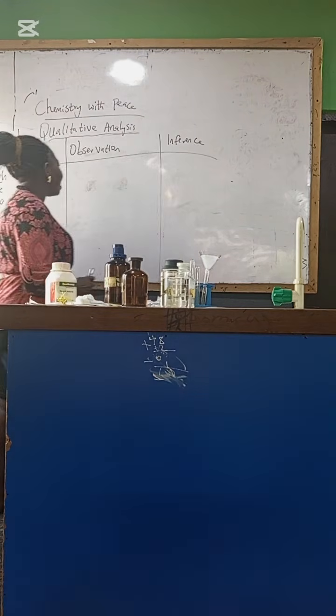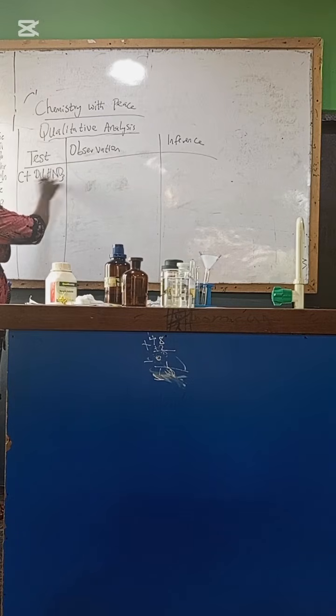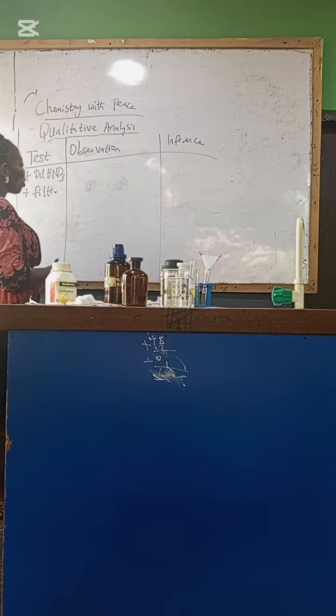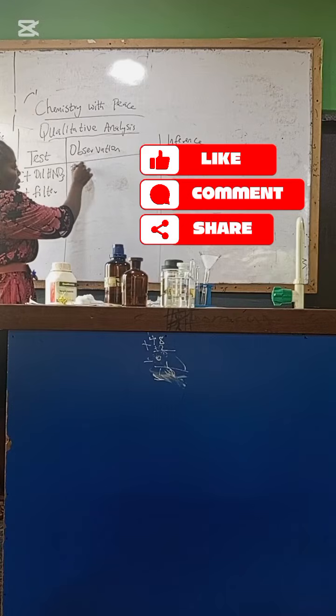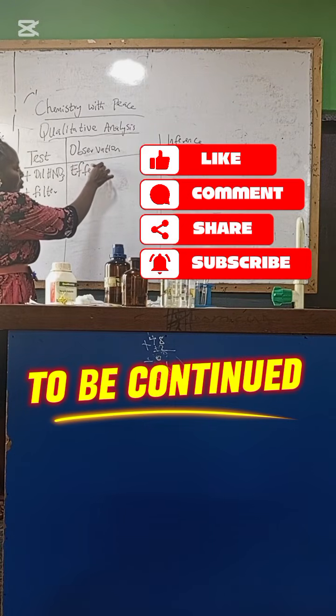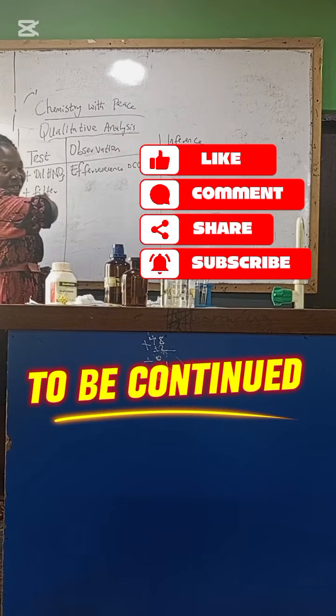Look at what we did initially. We tested C plus dilute HNO3 plus filter. When we added dilute HNO3, effervescence occurred.